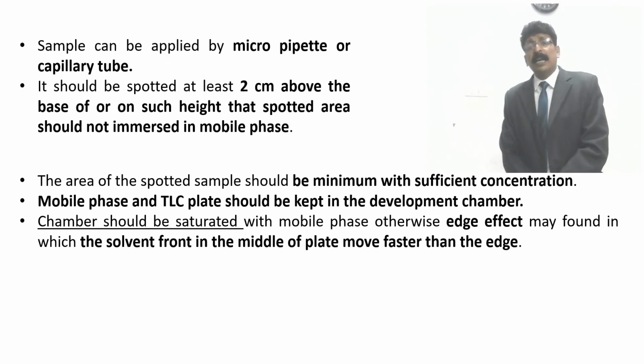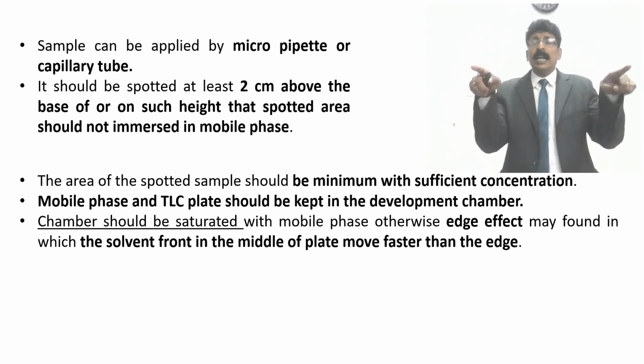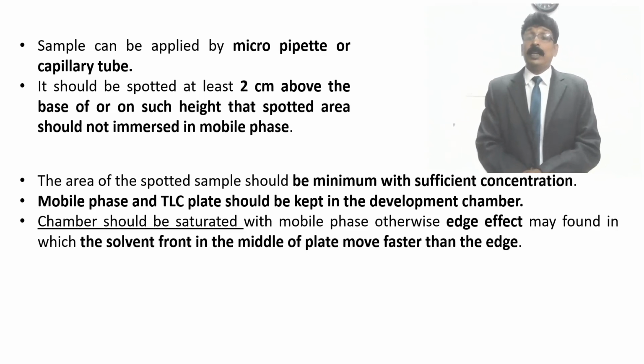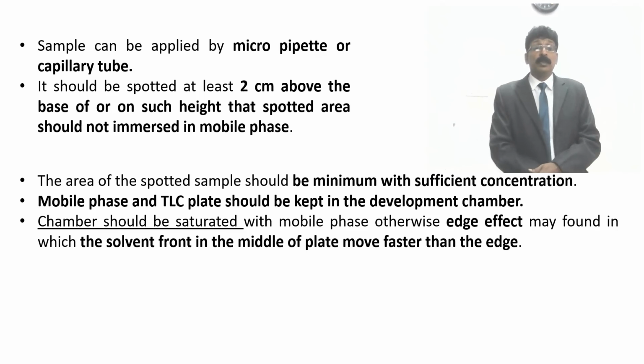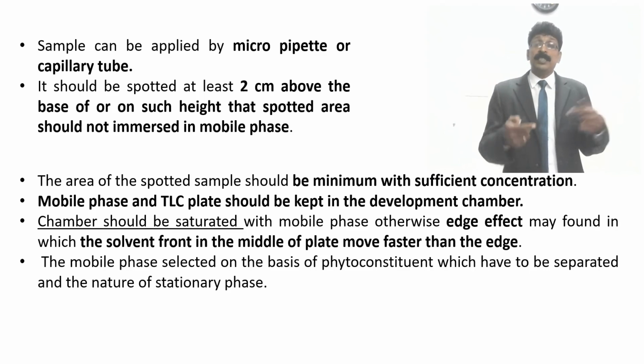What do you mean by edging effect? Curve. No straight line of the solvent system movement may be there. So these can all be avoided. When you have the edging effect, the solvent front in the middle will be faster and the sides will be slow. We can see the picture I have shown in the next slide.